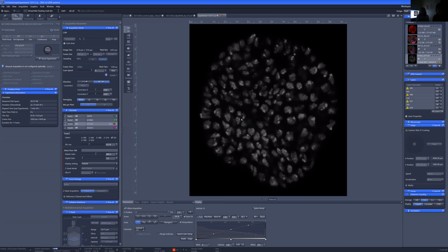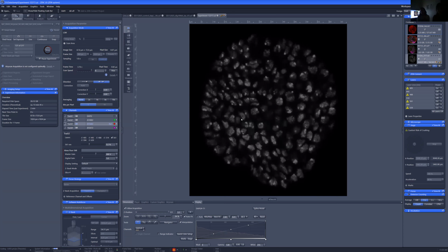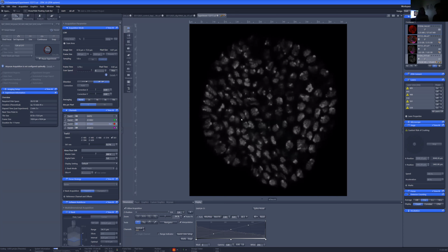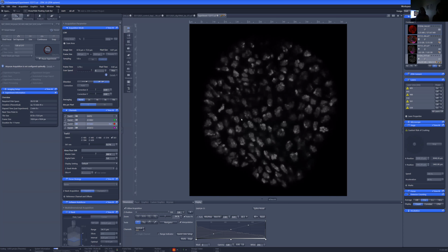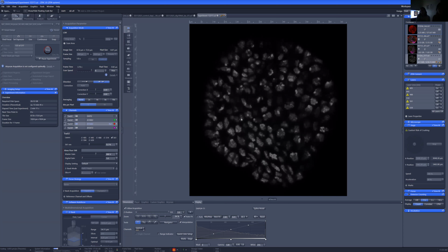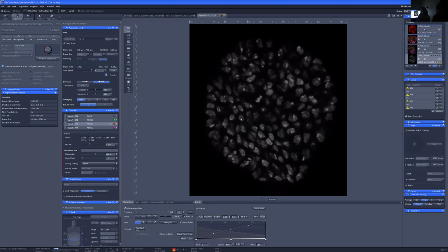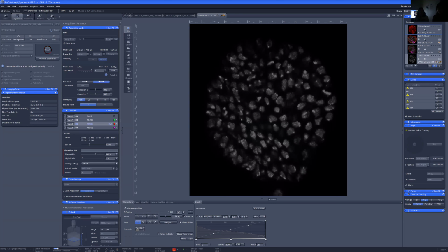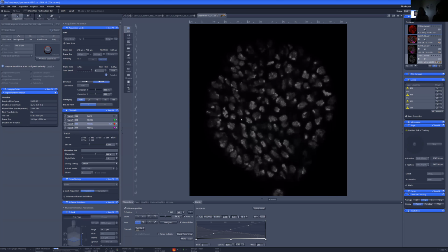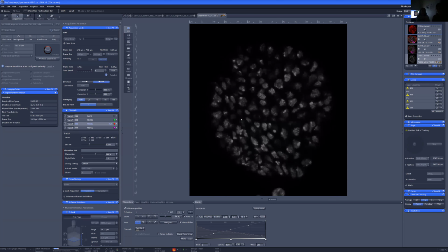The entire image is going to take about 13 minutes to acquire. We're going to be looking at 4 different colors in one image, so about 12 divided by 4, roughly, we're going to be imaging the DNA for about 3 minutes. Then in about another 1.5 minutes, we're going to be imaging a different channel. I think the next one that comes up is the traffic jam. These are going to be the cells marked in green, and they're going to be marking the nuclei of some of the non-stem cells.